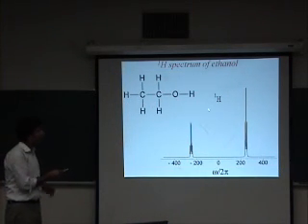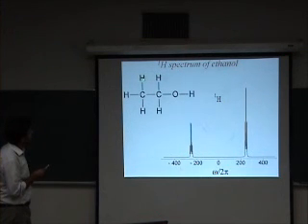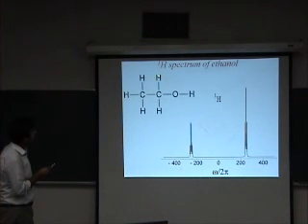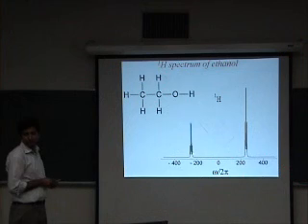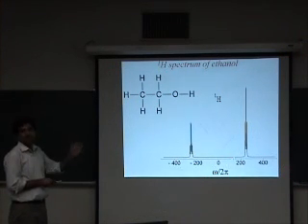Okay? And also remember that the coupling of this proton with this proton is symmetric. It's the same as the coupling of this proton with this proton. So if you take 2 peaks here, look at the frequency spacing, it will be the same as the frequency spacing between 2 peaks on the other. So coupling is a totally symmetric phenomenon.